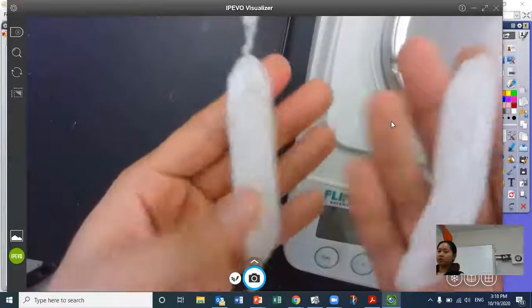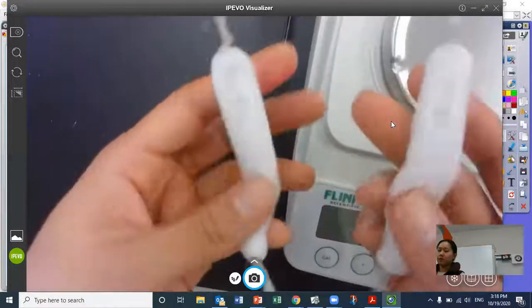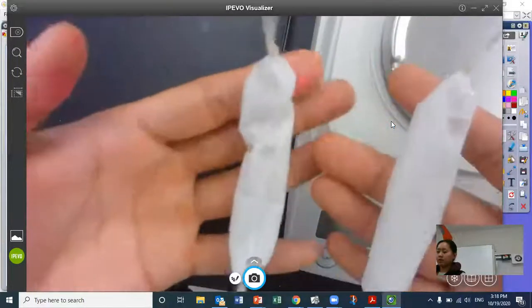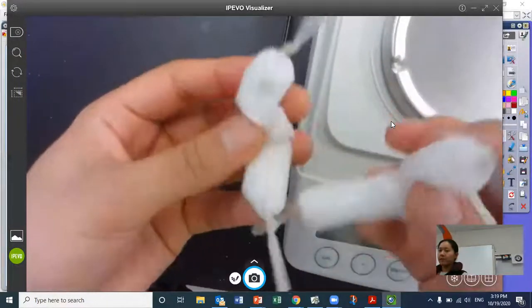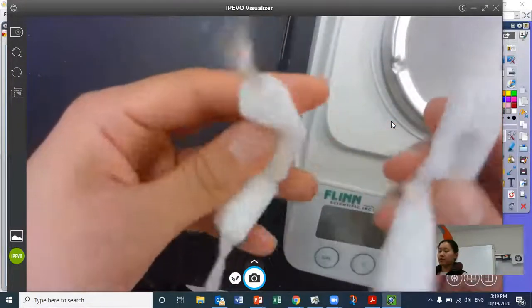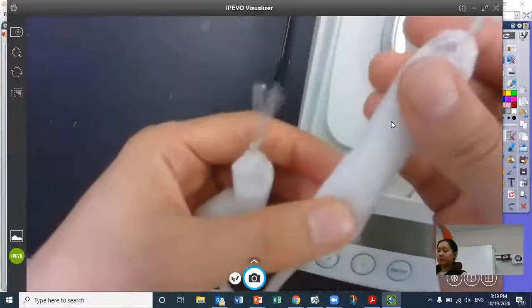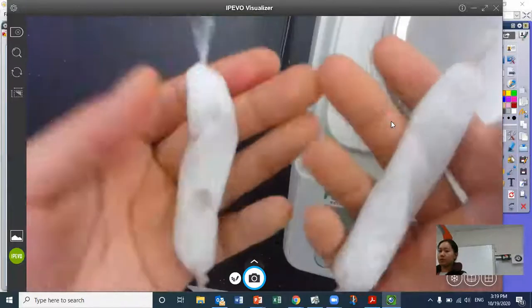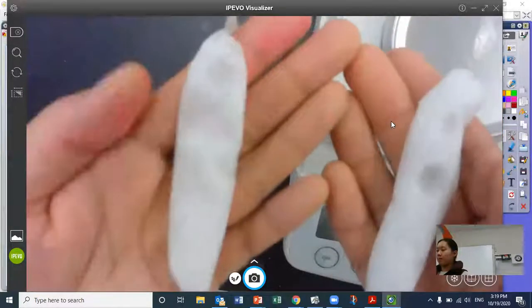They're both white because starch is white, right? Remember, we have the starch solution inside of the cells. And so the color initially is this. Okay, I've left them a little wrinkly because we want to leave room in case water goes in. We also want to make it full enough that we can tell when water leaves, so it gets more and more saggy. Okay, so we have our two, and we're going to mass them.